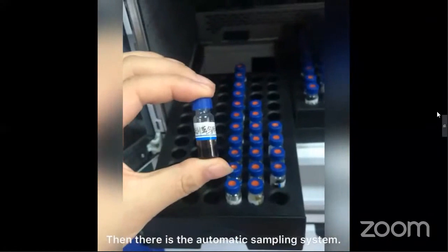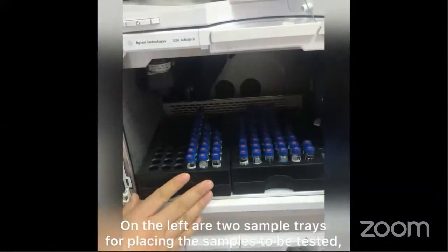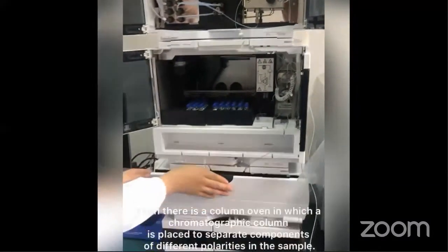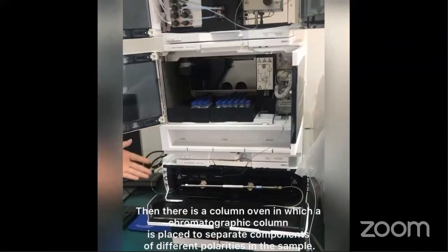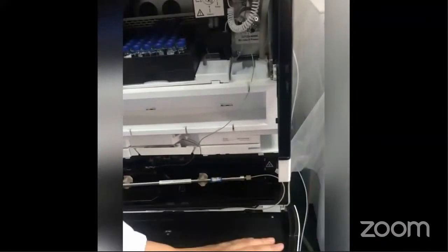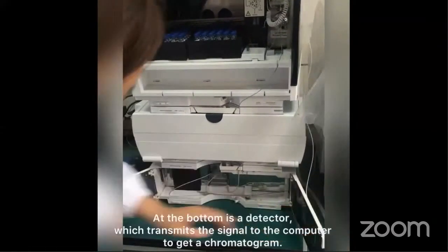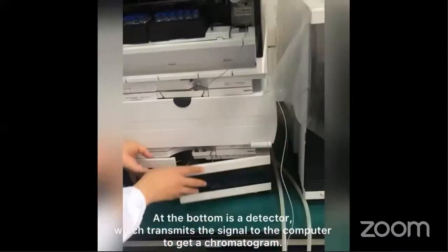And there is the automatic sampling system. On the left are 2 sample trays for placing the samples to be tested, and on the right is a 6-way valve. Then there is a column oven in which a chromatographic column is placed to separate components of different polarities in the sample. At the bottom is a detector, which transmits the signal to the computer to get a chromatogram.